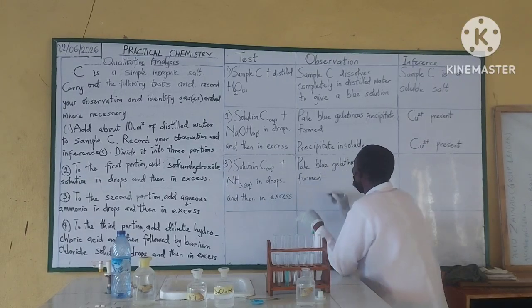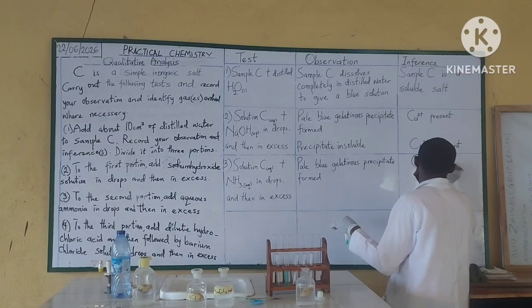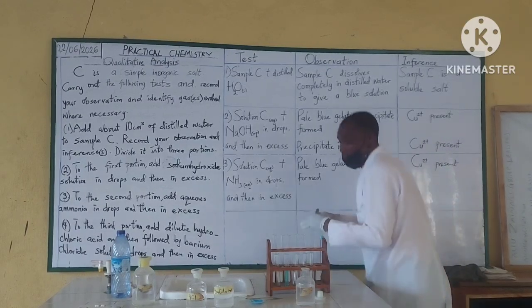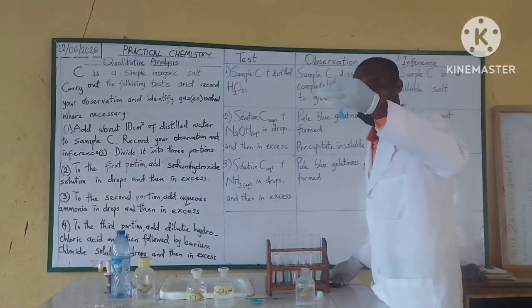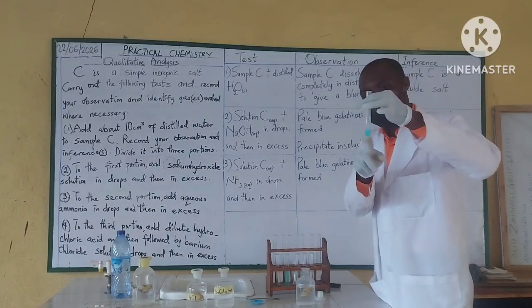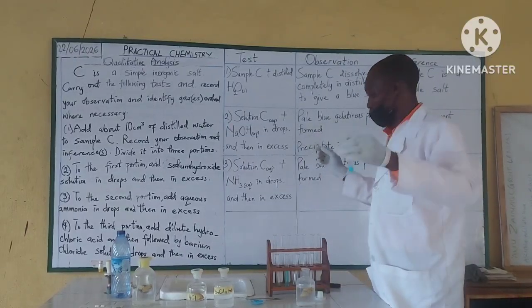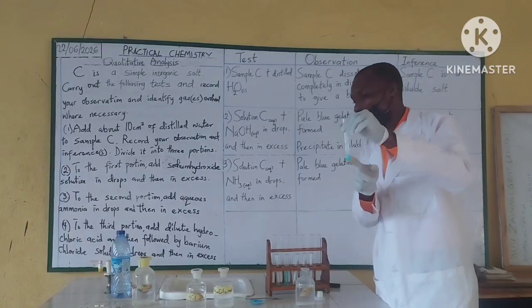For Cu2+, precipitate. That's in drops. You can see the pale blue, like that of sodium hydroxide solution.